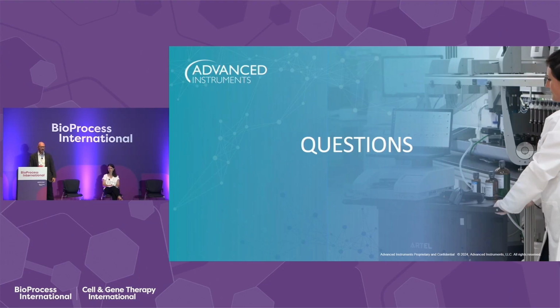Yeah, because after 48 hours, the viability drops, right? Whatever cell you recover, at 24 hours the viability can be 90%, but at 48 hours it drops and at 72 hours it can drop further. So I don't know how accurately you can measure. Well, like I said, I don't remember the timing on that particular study. I was just using it quickly for representation. So you're welcome.